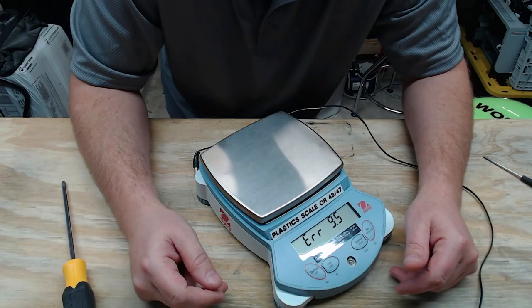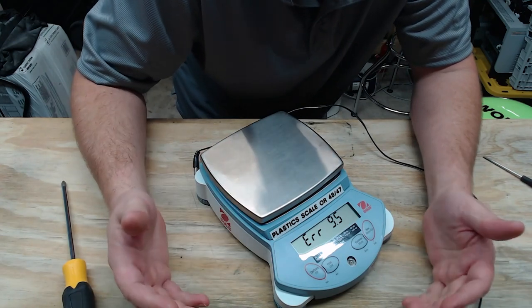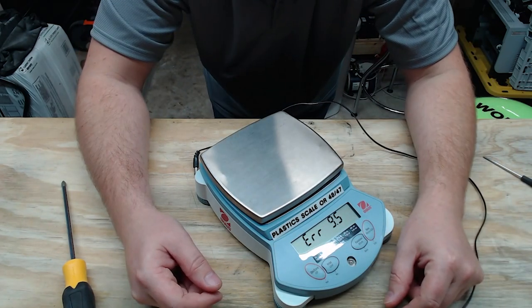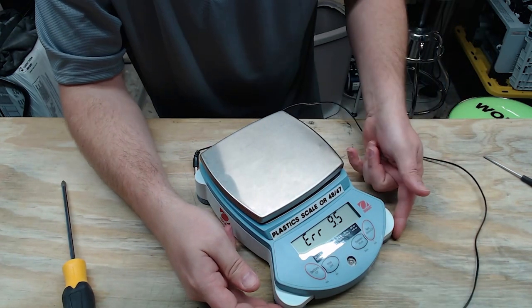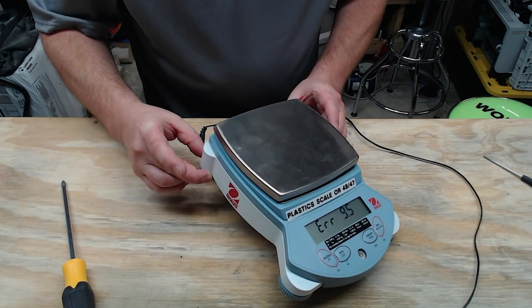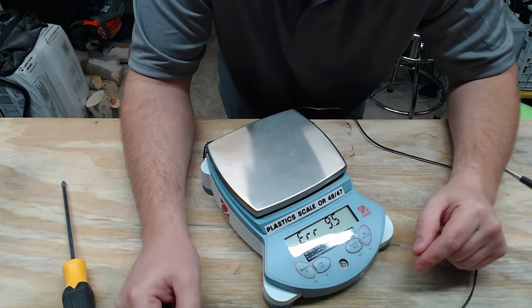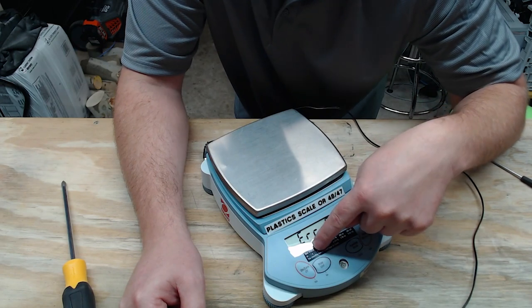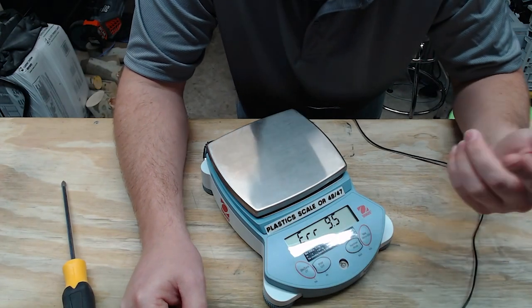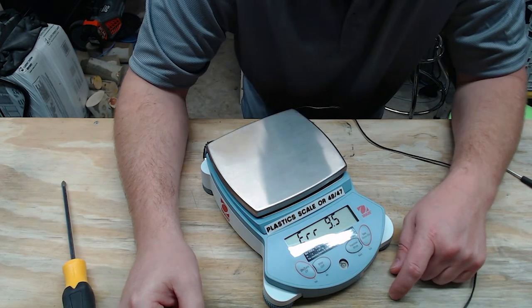What we have here is an Ohos digital scale. Ohos is a very well-known brand and their scales come in all different shapes and sizes. This is a typical benchtop scale that has an AC adapter and alkaline batteries underneath. The scale's maximum rating is always labeled somewhere — this one is rated at 8,100 grams, which is just over 8 kilograms, so it's a pretty hefty little unit.